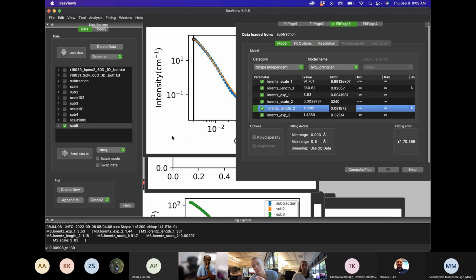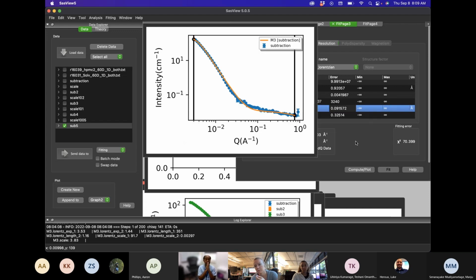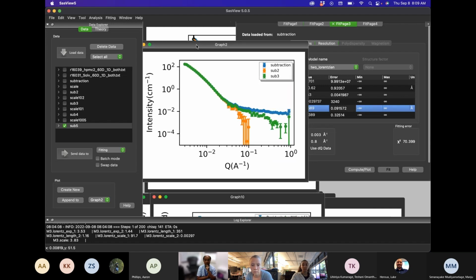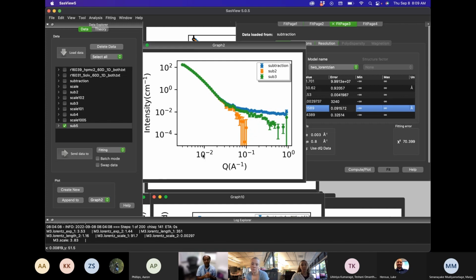Yeah, so the problem with these exponent fits is you can misinterpret if you did not do proper background subtraction. If you don't know where the background is, then it's difficult to say, because if I keep subtracting, the higher Q will be far more sensitive. Whereas the low Q, on the left side of the curve, background subtraction is not as sensitive. So your slope is pretty well defined. But at high Q, on the right side of your curve, you're very close to background. If you cannot determine the background correctly, then it's arbitrary how much you think is background and subtract. And that's what would force your exponent.